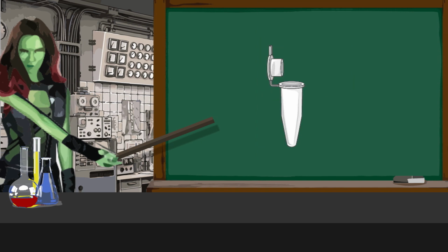You're going to need to pellet your induced cells. So this is what you do. You take your 2 milliliter microcentrifuge tubes labeled induced cell pellet with your initials, and then your induced cells will be pelleted by aliquoting 2 milliliters of induced cell culture into each of the 2 labeled 2 milliliter microcentrifuge tubes. And then those tubes will be centrifuged at 16,000 Gs for 2 minutes. Then you discard your supernatant and store your cell pellets at negative 20 degrees Celsius.